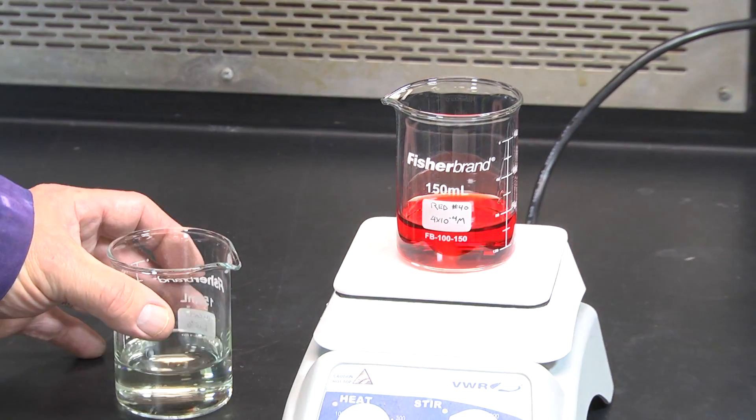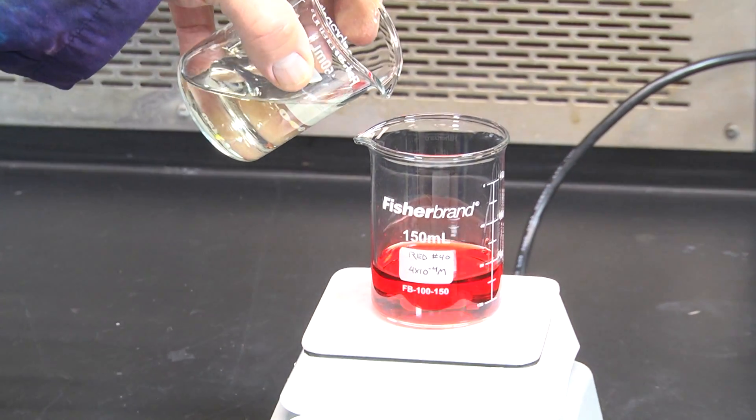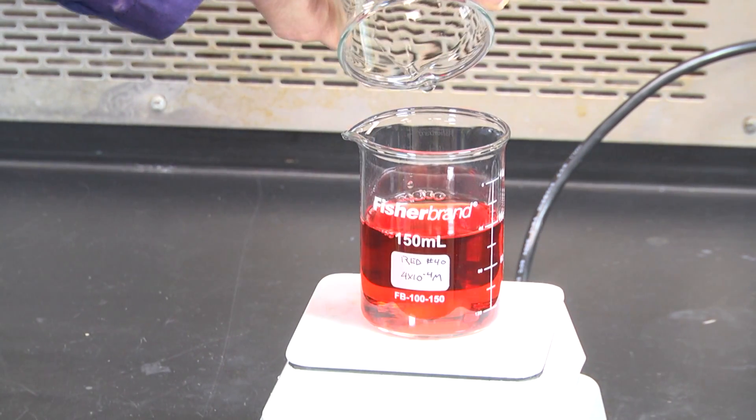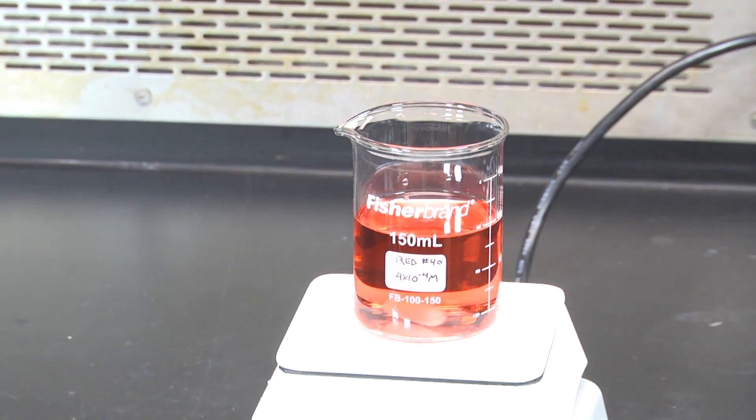First, let's see the reaction. The dye is Allura Red, also known as FD&C Red dye number 40. We can tell the dye is reacting because the color of the solution goes away.